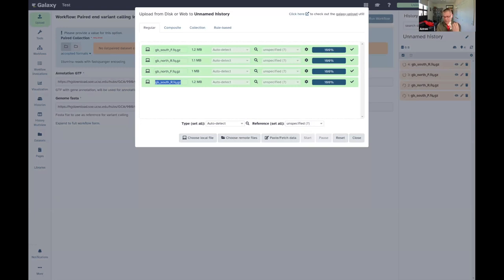Again, this workflow is designed to work on Illumina data, or, more rare at this point but maybe quite common in the future, Element Biosciences types of data sets. Illumina and Element Biosciences are two instruments that generate short reads, and you can do this in paired end orientation, and they generate quite a few of them.